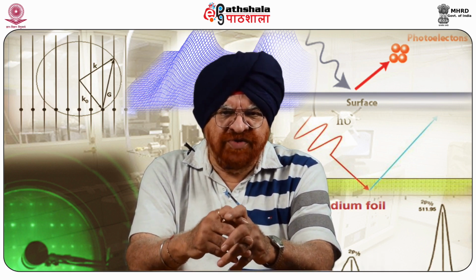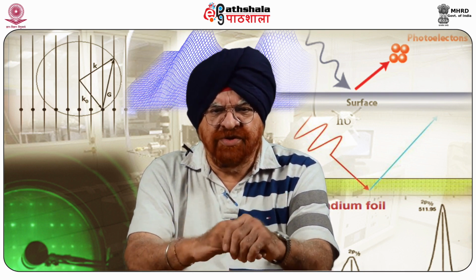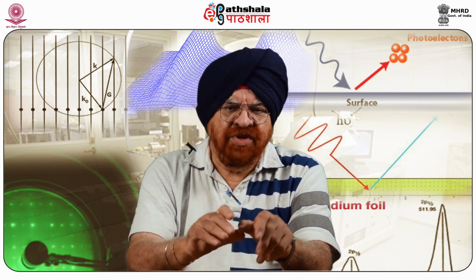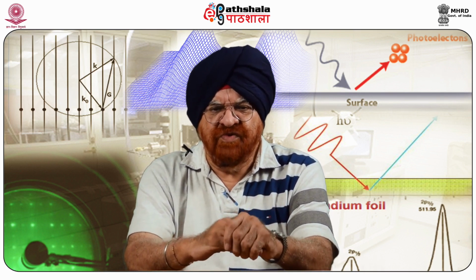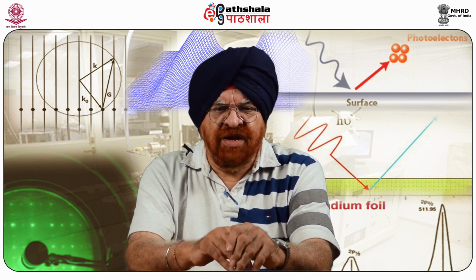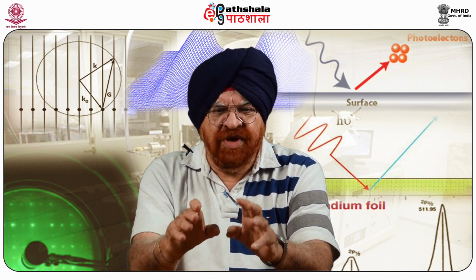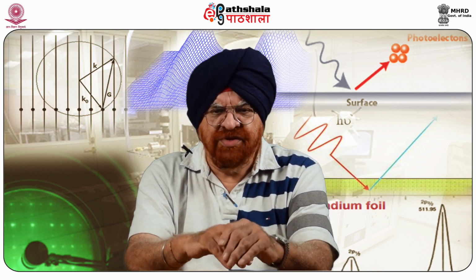The lower part shows the frequency modulated mode AFM system for topography measurements, and the upper part shows the components for CPD mapping, including the KPFM controller and the lock-in amplifier. In this slide, the dashed line and the bold straight line in the diagram show the AM and FM mode KPFM configurations, which are both very important when operating this.